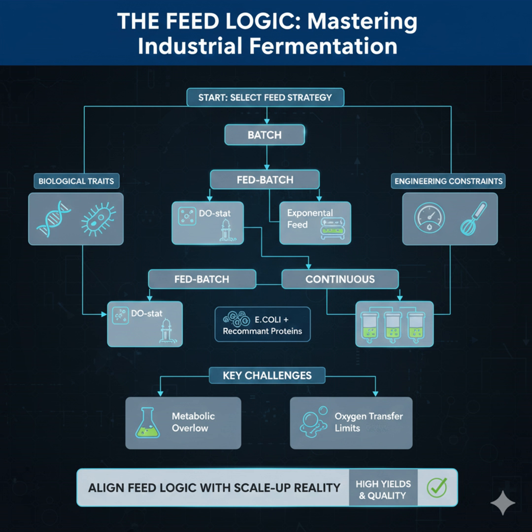So here is the final provocative thought for you. The most effective feeding strategy is never found in a generic textbook or some starting recipe. It is found by picking the mode and the feed logic that keep the organism away from its bad habits, overflow, repression, stress, for the substrate you actually have and at the largest scale you actually run. That highly specific, tailored level of control is the fundamental difference between simply running a high-yield process and consistently producing a reliable, high-quality product. Thank you for sharing your sources for this deep dive.